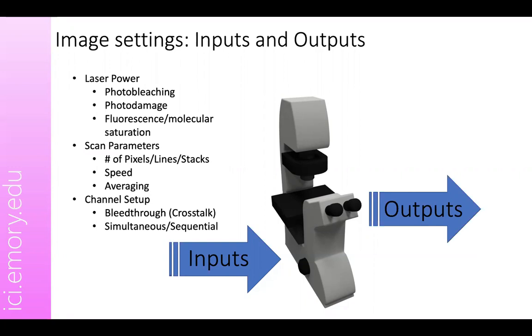And all these setups really are important if your fluorophore is dim or weak. If you want to achieve a higher signal to noise ratio, at times you will have to average your sample so that you can remove much of that noise even before you acquire the data. A good image is really important before you start image analysis. If you have lots of background noise, that's going to affect image analysis.